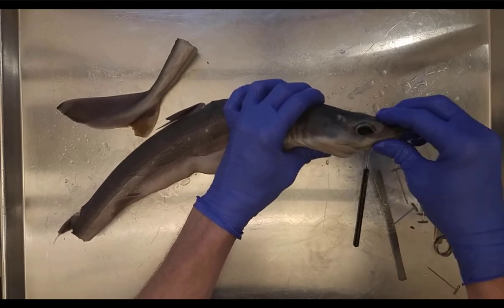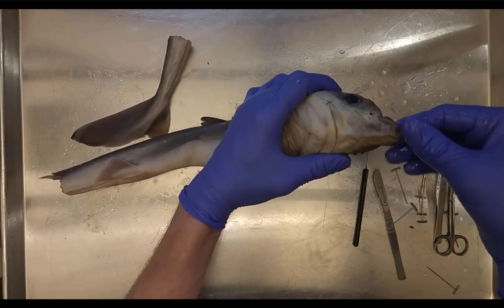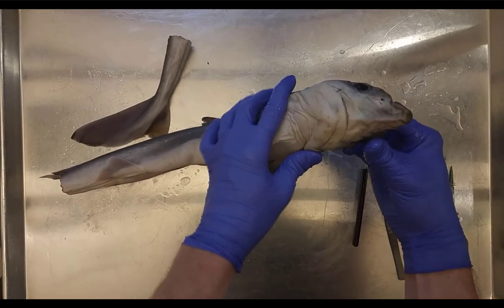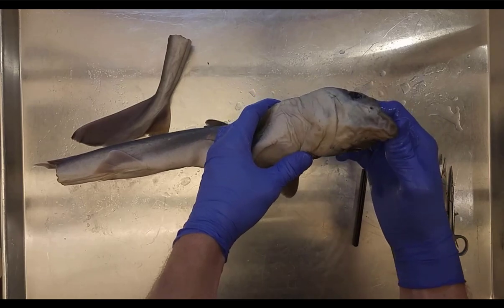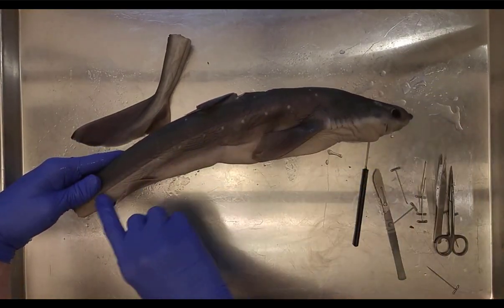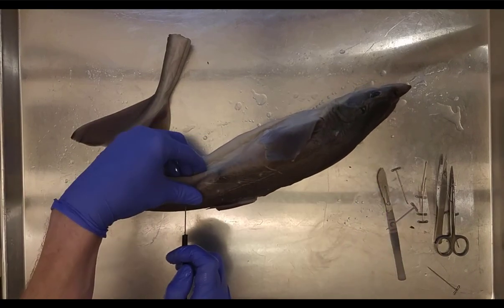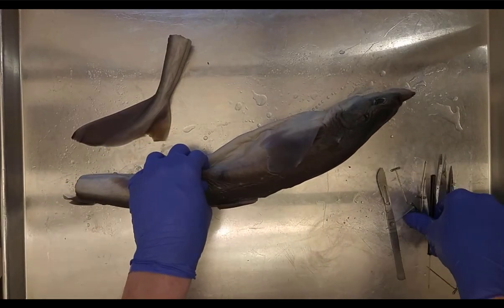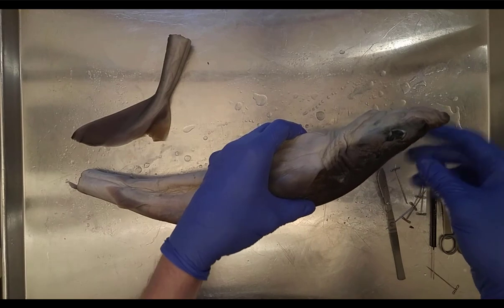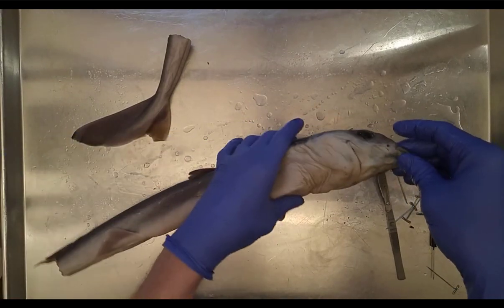Anterior to the eyes we have the rostrum — all of this area is the rostrum, which is very important for sensory function. There are nostrils in here, and if you look closely at your specimen you'll see tiny holes dotting all along the rostrum. These are the ampullae of Lorenzini, which are used for detecting electrical currents from prey. Along the lateral side you'll also see the lateral line system, used for detecting vibrations underwater.